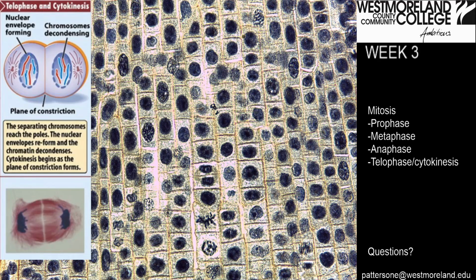So can you find the cell here that is almost separated but not quite there in telophase? It's this cell. We can see some spindle fibers maybe on the edges of the nuclei, and then the line in the middle just isn't thick enough and just barely doesn't seem to get the whole way to the cell walls, making that into two separate cells. So that's our example of the cleavage furrow and the plane of constriction in the plant cell.